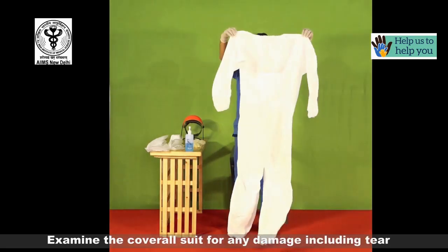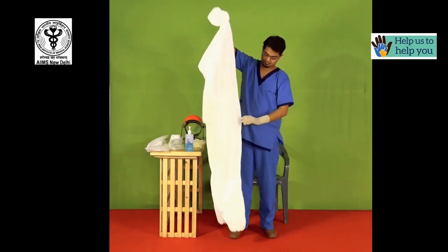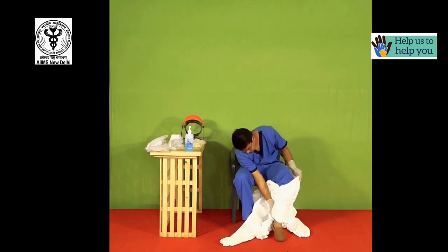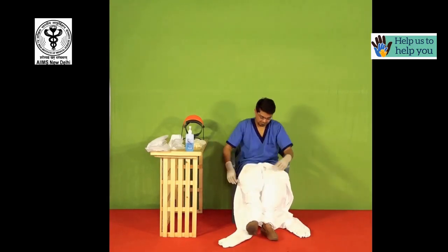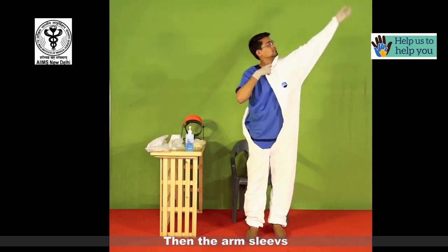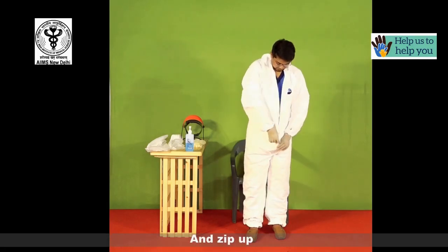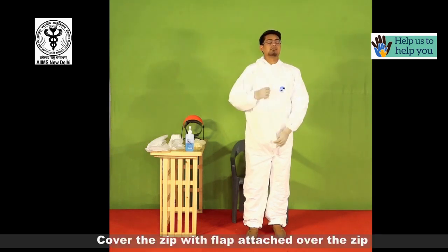Examine the coverall suit for any damage including tears. Start by wearing the leg sleeves, then the arm sleeves, and zip up. Cover the zip with the flap attached over the zip.